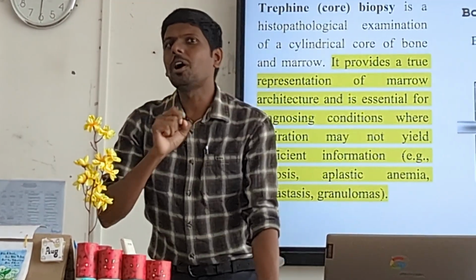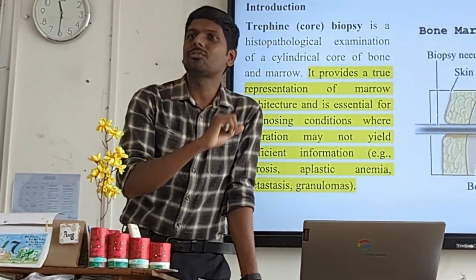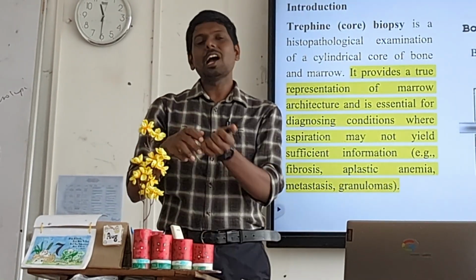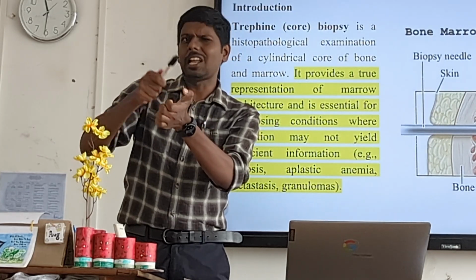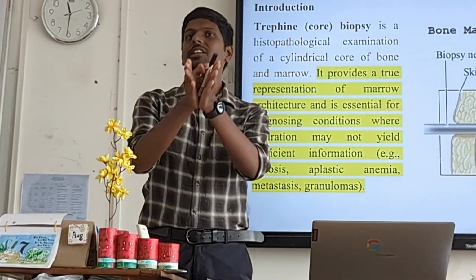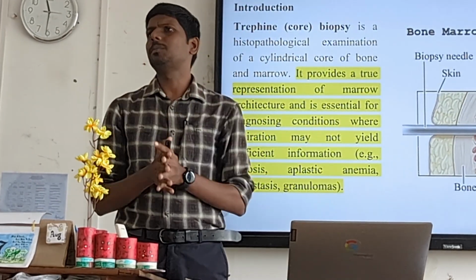That is the same problem we are facing with our tissues. Our tissues are like a piece of cake, not like a potato. Even though we have the sharpest knife, when we try to cut the tissue into slices, it won't cut, just like the problem with the cake. Then how to overcome this problem?